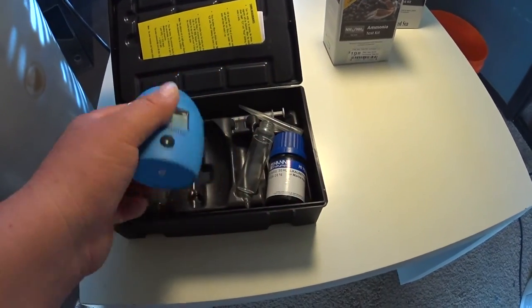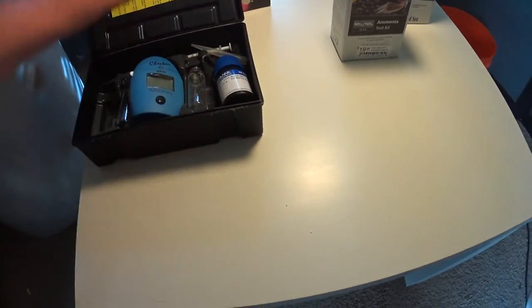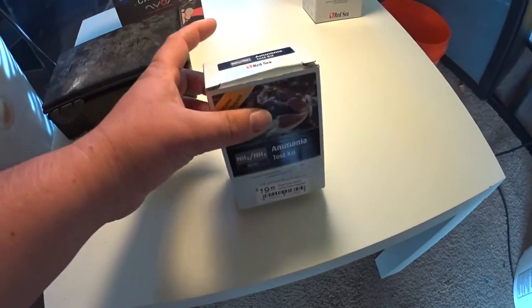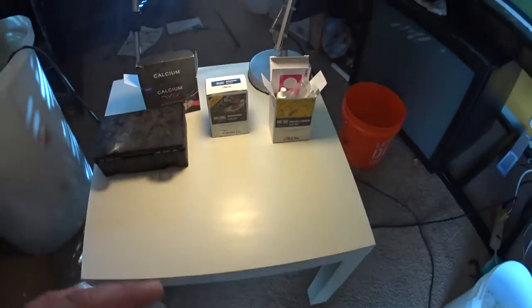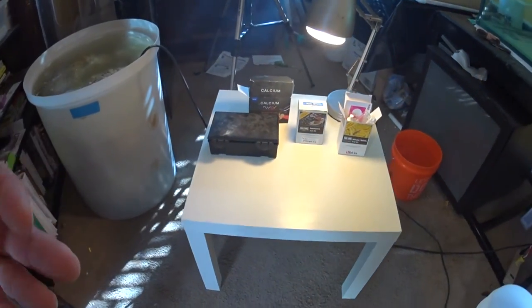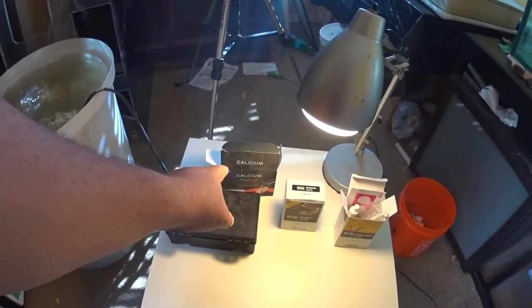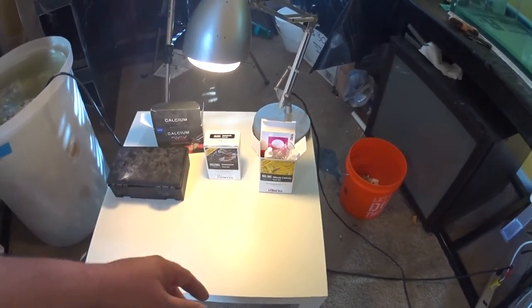For ammonia, I use Red Sea. I use Red Sea ammonia and then nitrate and nitrite. I used to use the Red Sea calcium, alkalinity, magnesium test kit, but since I like how easy the NIOS one is to read and the HANA checker does it for you, these ones are pretty easy to read.